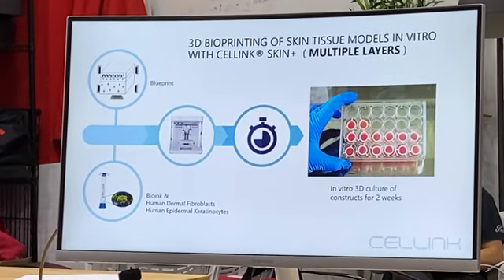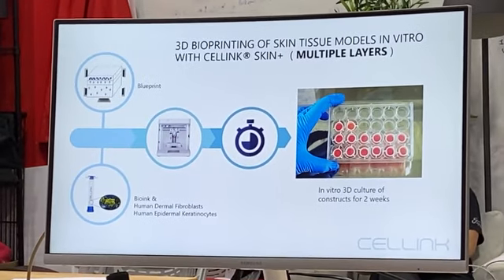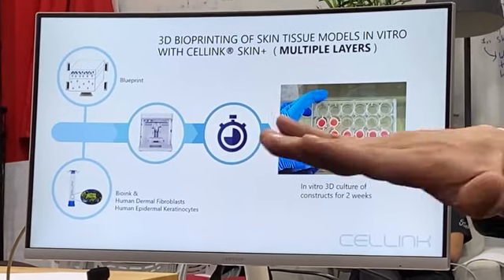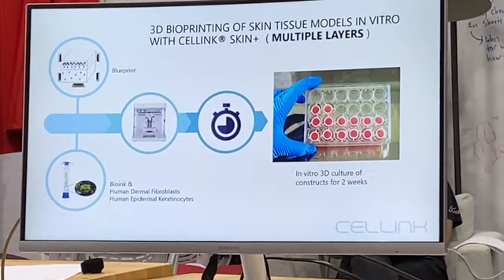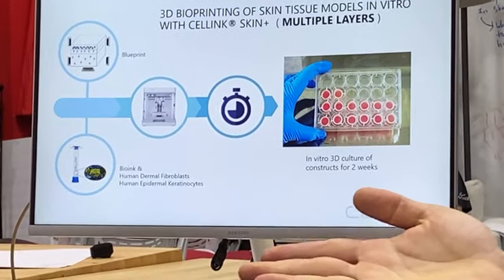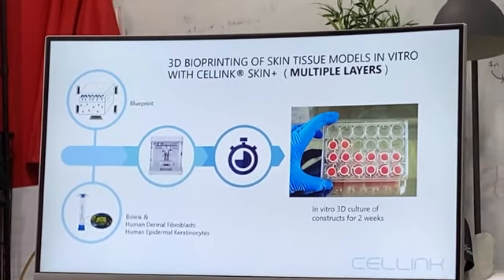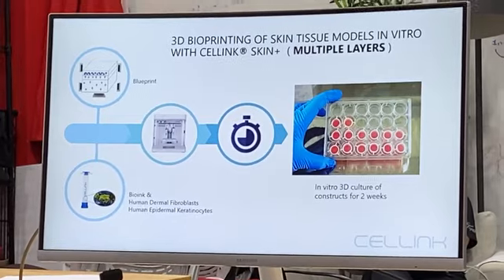And you have to guarantee that you can mix different biomaterials at the same time, and there is no slop. For example, when you mix PLA with ABS, what happens? Tell me. It won't stick. Exactly. So they have to guarantee that when you mix different biomaterials, they keep together.